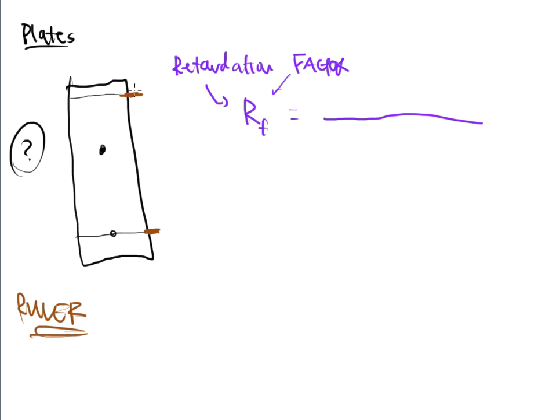If you let your TLC plate develop too long, the mobile phase front goes up here to the top, but everything else is going to kind of move. And you can't get a proper reading of a mobile phase front. And that's why you have to pull the TLC plate out early every time, so that way you can get this proper distance. Very, very important in TLC development.